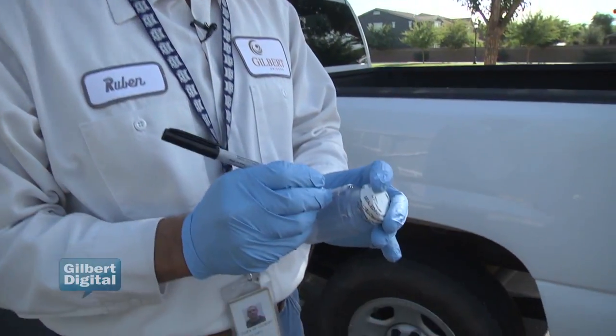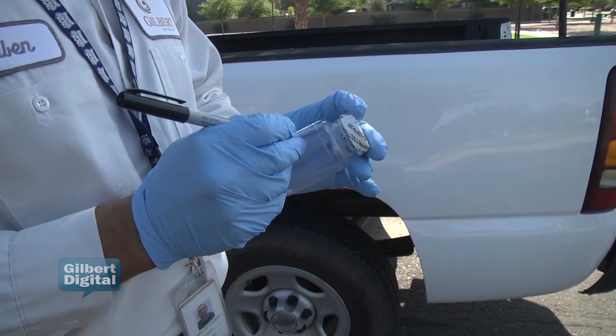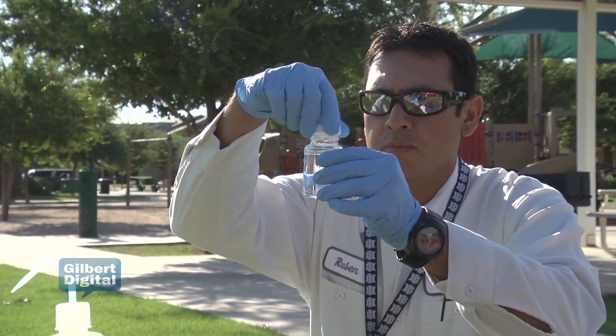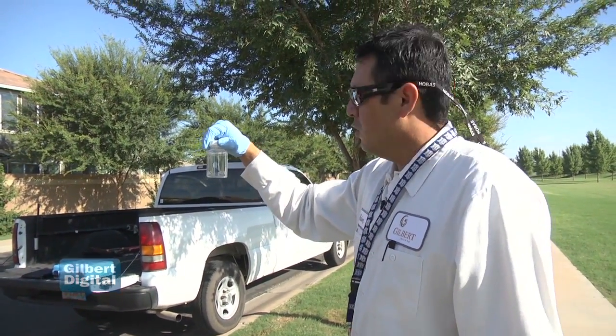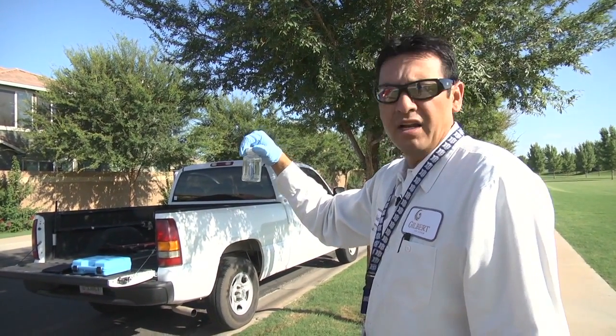We put the date, the time. We got a bacterial sample from our station number 44, ready to take to our state-certified lab and get analyzed.